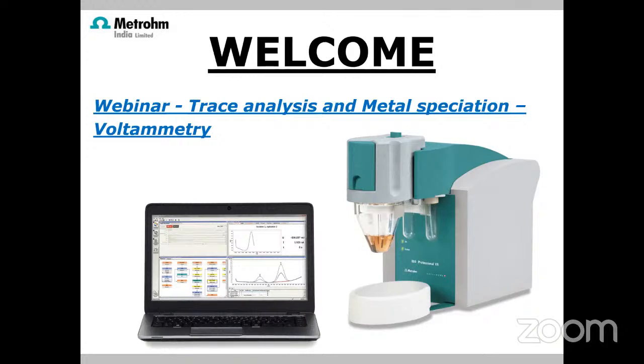Chromatography-based techniques. As I said earlier when I started my lecture, these are chromatography, spectroscopy, and electroanalytical methods. So these are the main analytical methods. We have seen spectroscopy, so now we will see one of the electroanalytical methods used for the analysis of metals especially. This instrument is only for metals down to PPB, PPT. We talk about sub-PPM to parts per trillion here. That's the specialty of this instrument.